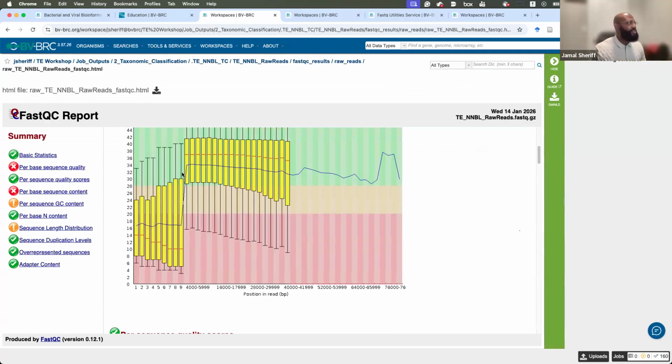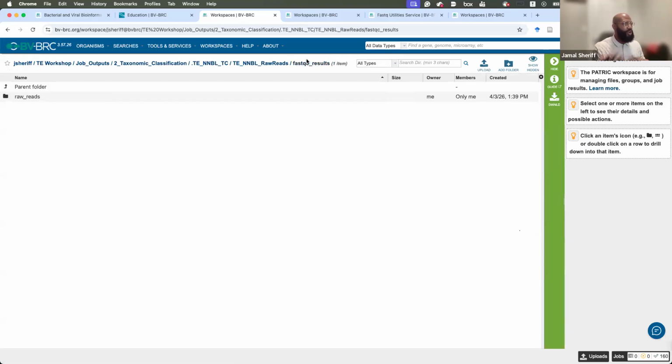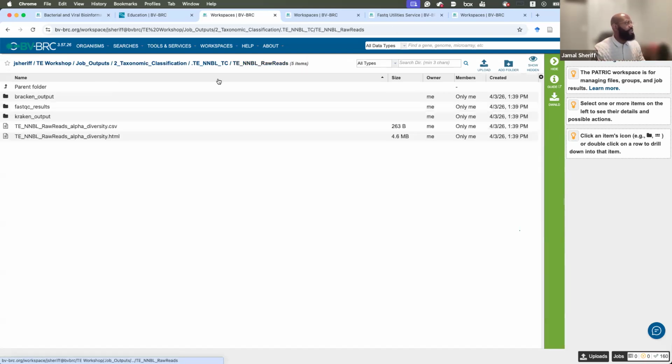As you'll see, there's some services that do multiple things, and there's some services that do particular things. I want to show you first how to do something particular. So you know how to do it. You can set the parameters, understand it a little bit deeper, but you will see that there are going to be times where like this, where you have taxonomic classification, but also quality control reports that are included.